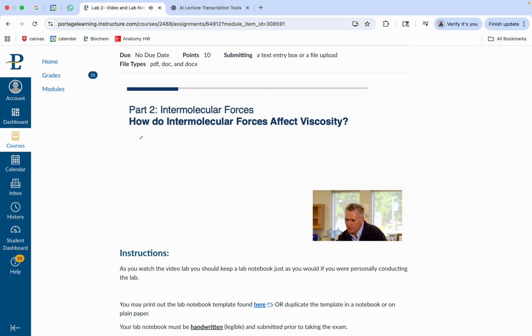Now, we did three more, and remember these next ones all had London forces, but we want to see the impact of London forces on the molecular weight, that is the length of the chain. So we look at heptane, decane, and then also hexadecane. Hexadecane, recall, was the one that was 16 carbons long, decane's 10, heptane is 7. So let's go ahead and look at the values for heptane. Make sure to record those. 1.81 for the first one for heptane, 1.96 was the second one, and then 1.71.